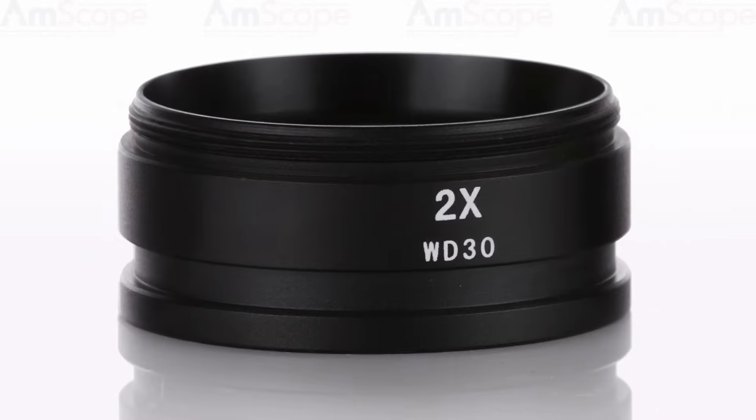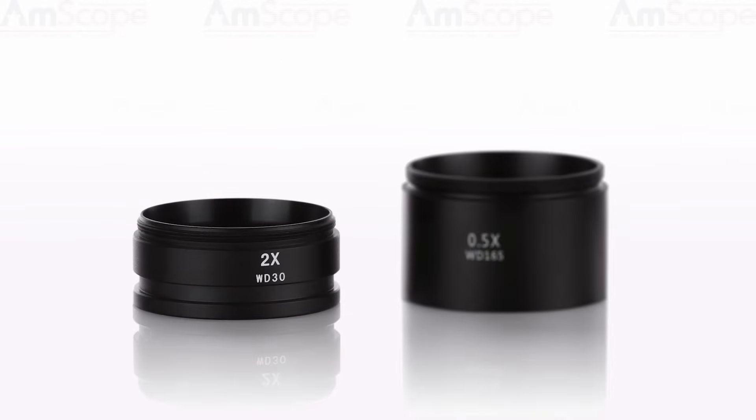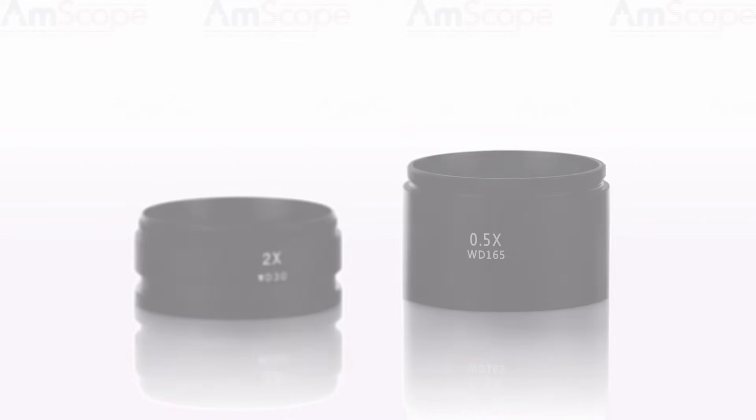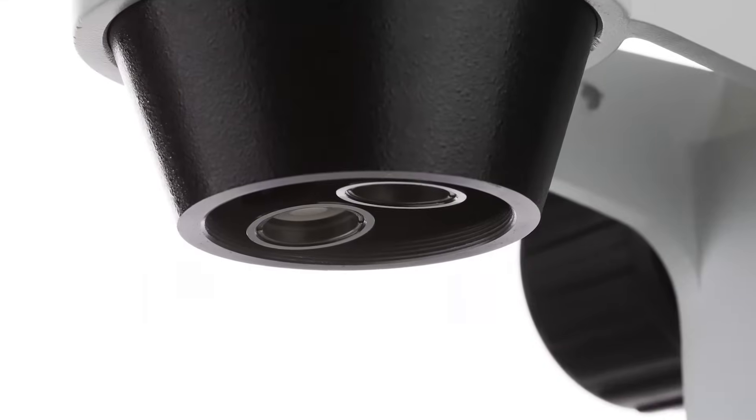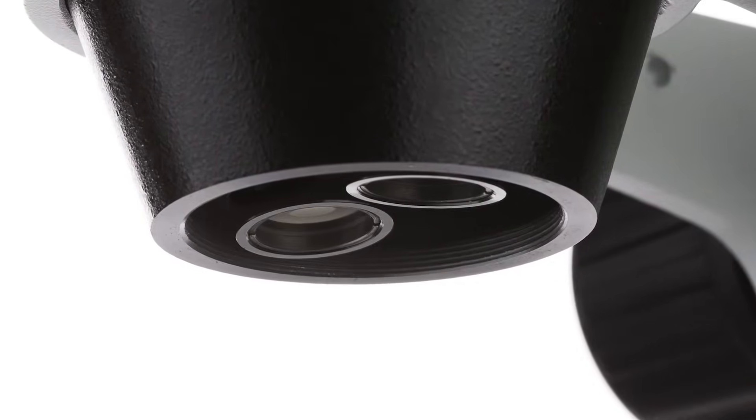The SM2 series head accepts a range of accessories. Among the most popular are Barlow lenses. These are auxiliary lenses that either increase or decrease the magnification by a set factor. Simple to install, they attach to the head's threaded lens port.